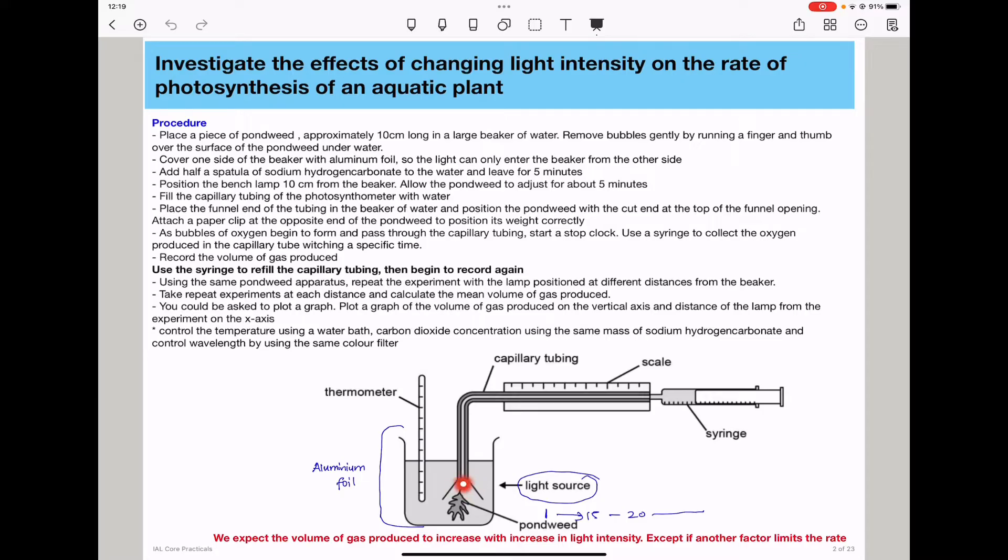This is what we're talking about here. The cut end has to face the funnel so that any bubbles of gas produced can go into the capillary tubing in order to be collected using the syringe. Attach a paper clip at the opposite end of the pondweed to position its weight correctly. As bubbles of oxygen begin to form and pass through the capillary tubing, you need to start a stopwatch and use a syringe to collect the oxygen produced in the capillary tubing within a specific time.